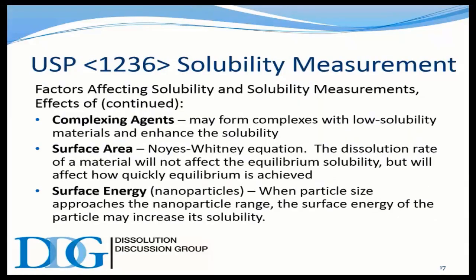All right. So there are other things that, this actually is the prelude of the question that was just asked, I guess, but factors affecting solubility, there's a continuation of the things: the complexing agents, complexes with low solubility materials can enhance solubility. Surface area goes into mentioning something I said a moment ago.